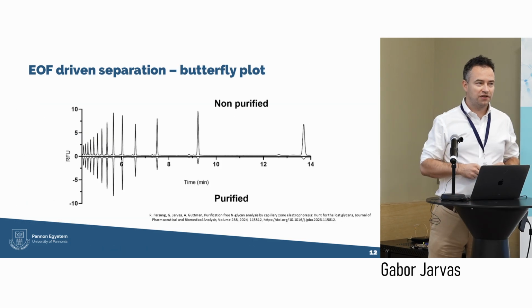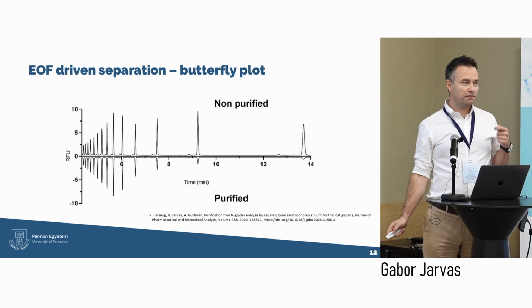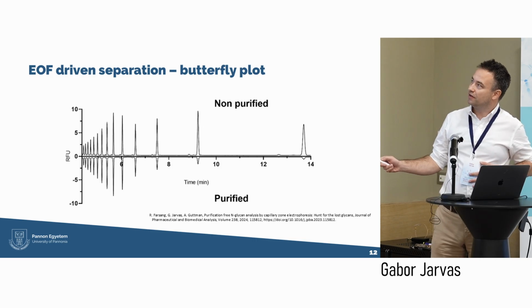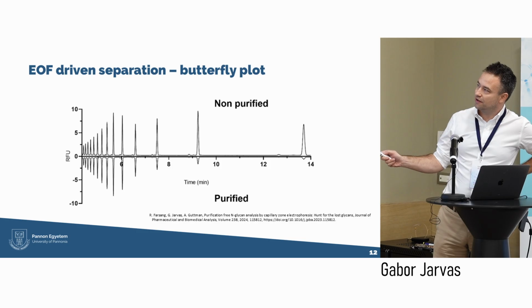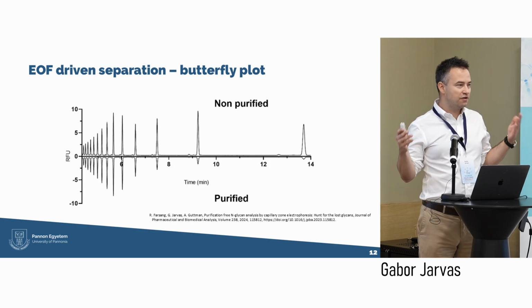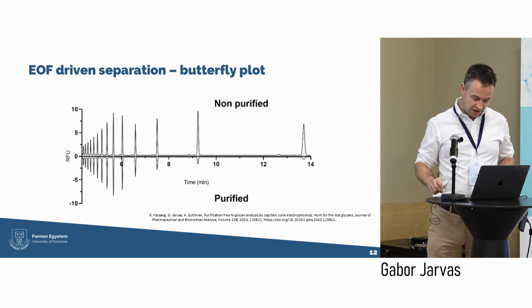Here's another good demonstration of the effect of the sample cleanup. In this butterfly plot, you could see this is the non-purified trace, and this is the purified. And it's so obvious. We lose sample, we lose glycans due to the sample cleanup.